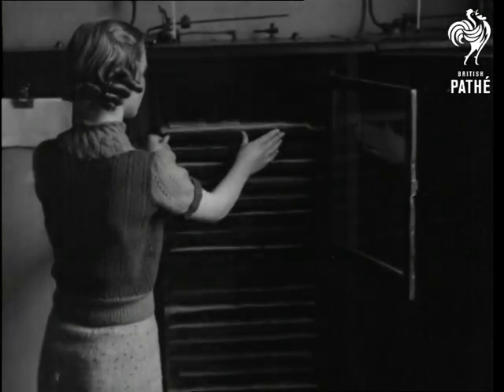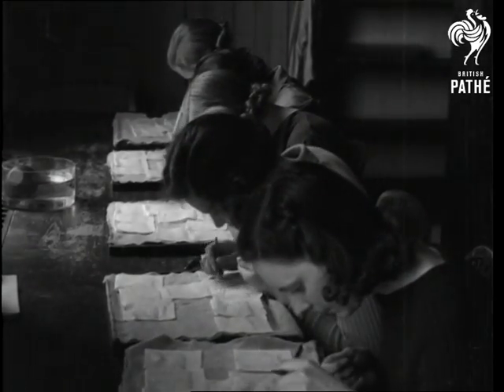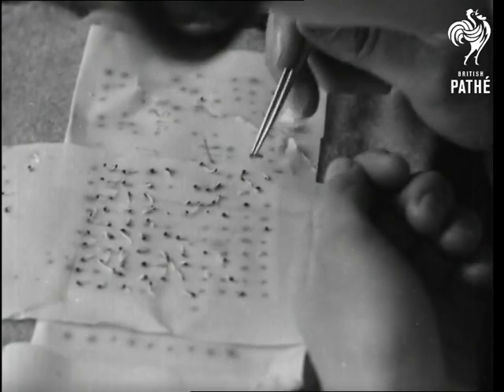The trays are placed in incubators. The seeds that have germinated are removed at intervals over a period of ten days, and the speed of germination and number of fruitful seeds per hundred is recorded.